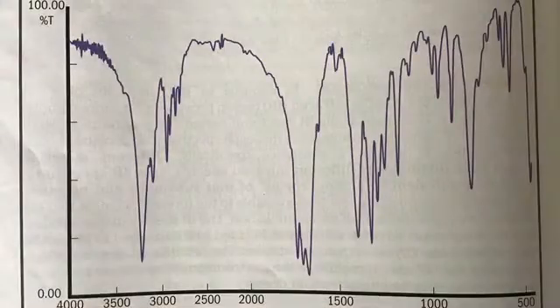Now I'll show you another spectrum of a different compound for comparison. This is a spectrum of heroin. It is considerably different from the spectrum of vanillin. Ultraviolet spectrophotometers are also used in crime laboratories, but their spectra are far less complicated, and they are best used for determining the quantity rather than the identification of a complex molecule.